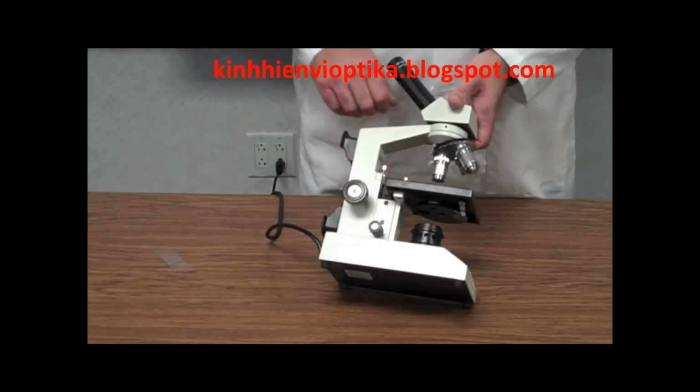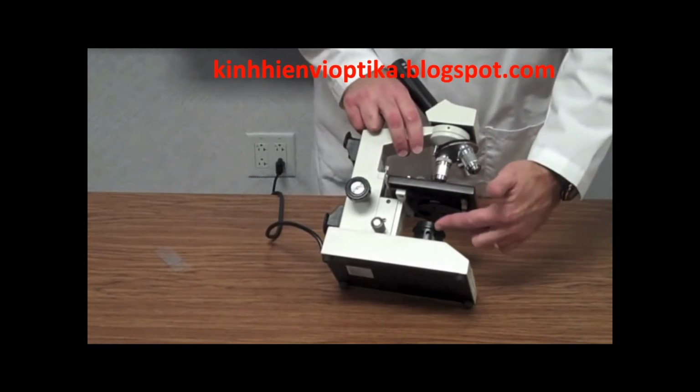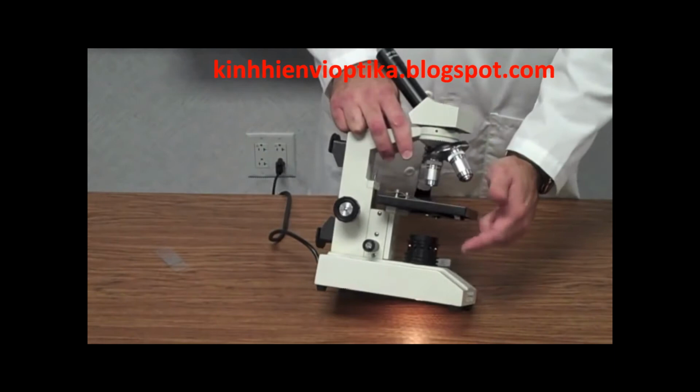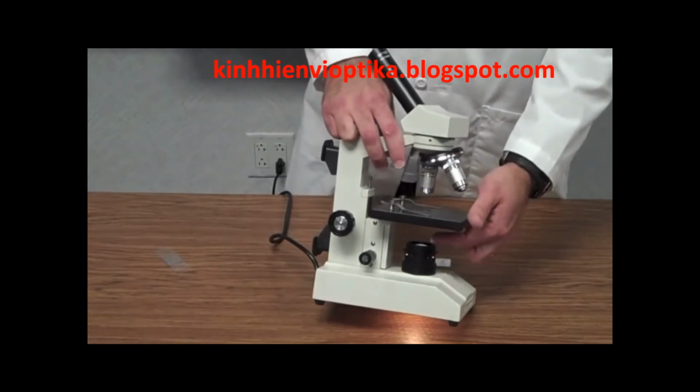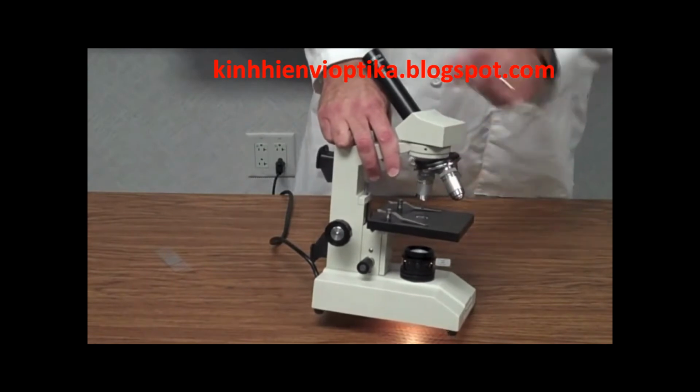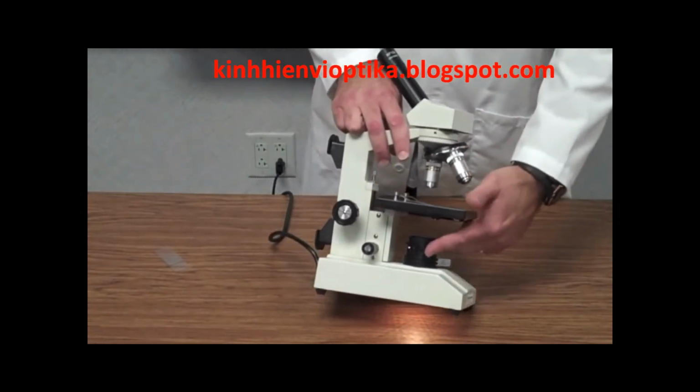You use the fine adjustment knob. Underneath the stage we have this right here. This is our light source. Okay, light source provides light to shine through the stage and then up through the objective and then through the eyepiece so that you can see it, our light source.